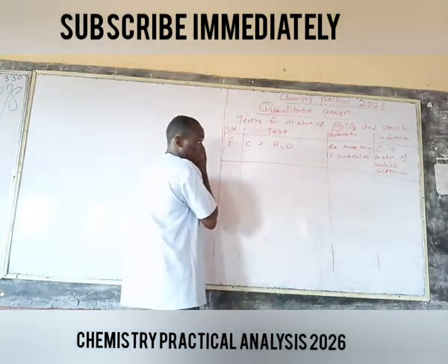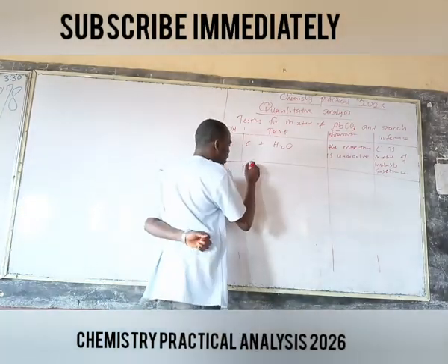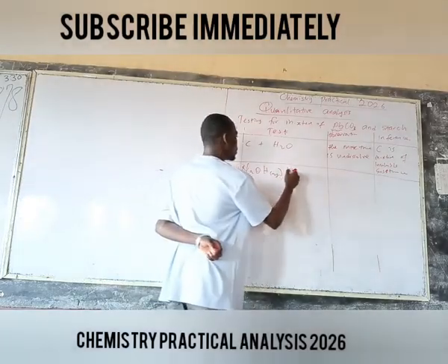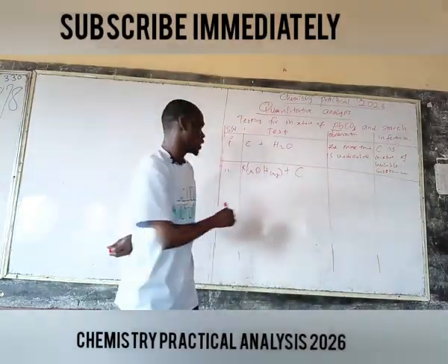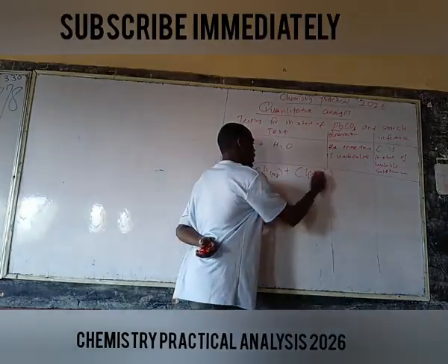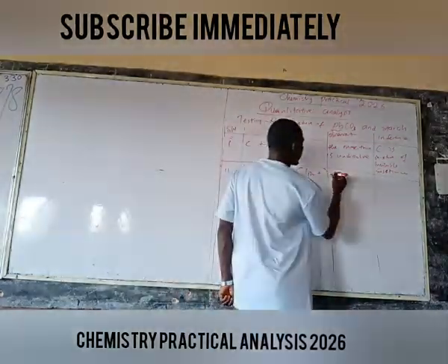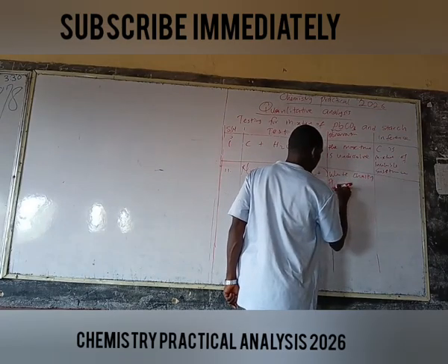Remember that in testing for lead, we add aqueous sodium hydroxide plus a portion of C. You can say C portion, or you can write just C. What do we expect? We expect to have a white chalky precipitate.